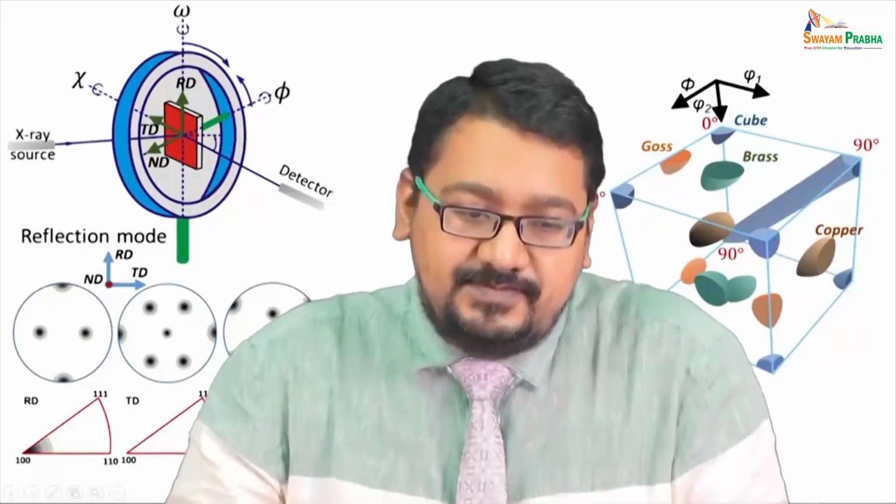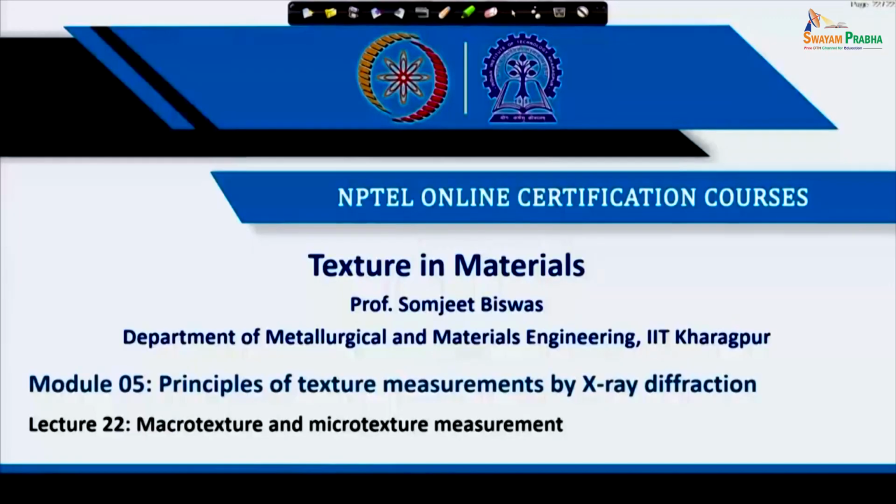Good afternoon everyone, and today we will start with module 5, that is principles of texture measurements by X-ray diffraction. This is lecture number 22, where we will try to understand macrotexture and microtexture measurements.